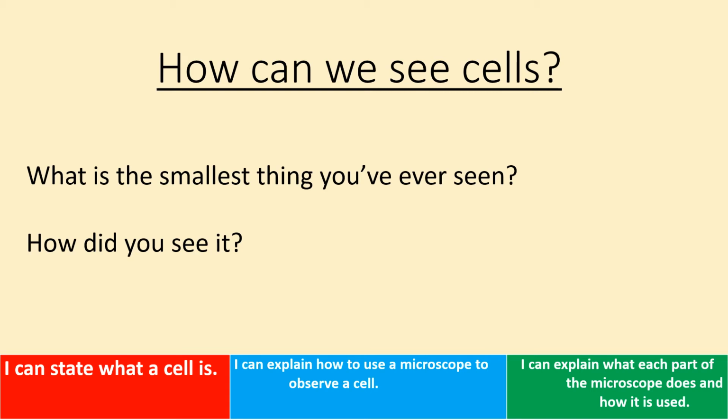Hello Year 7, it's Ms Redmond here with your first summary PowerPoint for the cells topic, which is called How Can We See Cells? And it's all about using a microscope.